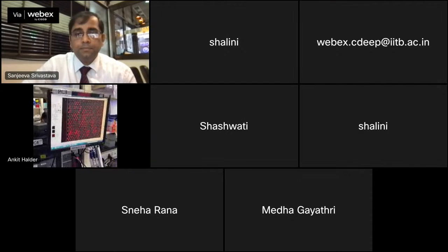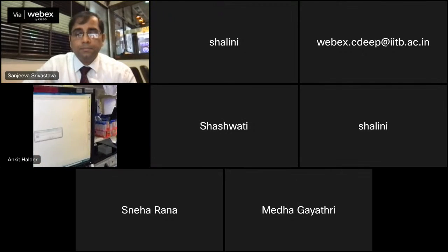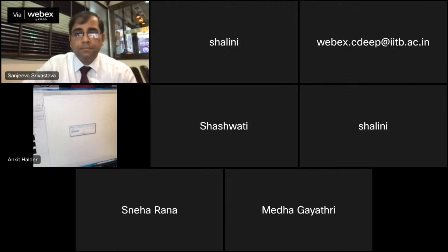After that, we just need to go to the results section. Then we select the data, and you can see the data is generated. This data is called the GPR file, the GenePix Results file, which is very important for further analysis of the data.